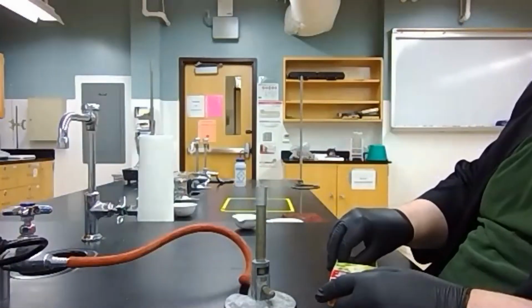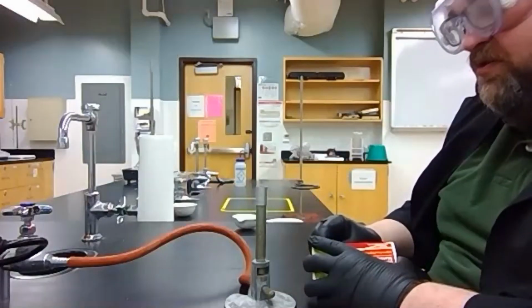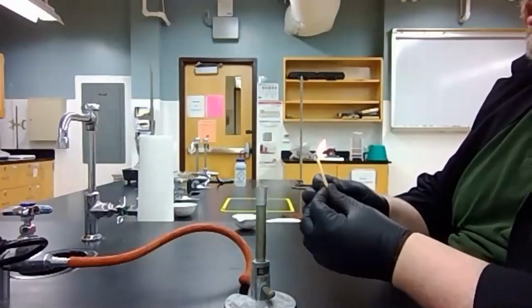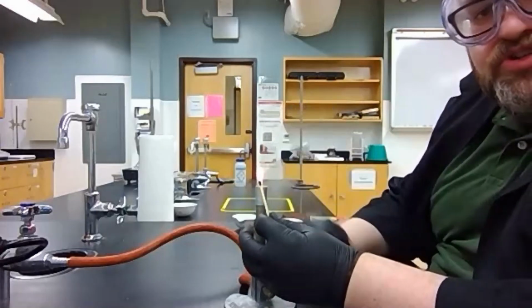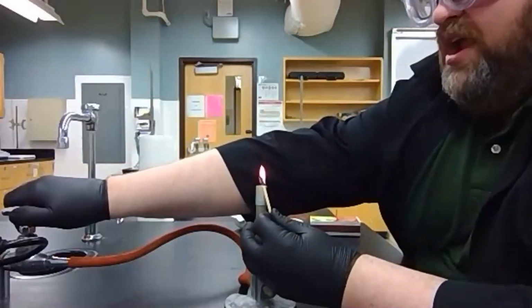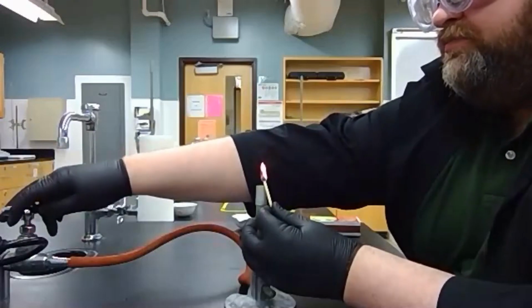So you can use a striker, you can use a match, you can use another Bunsen burner. I'm going to use a match in this case. So you strike your match, you make sure it's good and going, and you're going to hold it slightly off to the side. You don't want to hold it directly over your Bunsen burner. Then you're going to turn on your gas with gusto. Don't be afraid of it. Lean back, but don't be afraid. You don't want to lose your eyebrows.